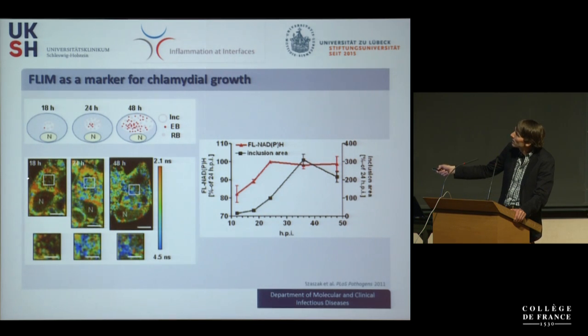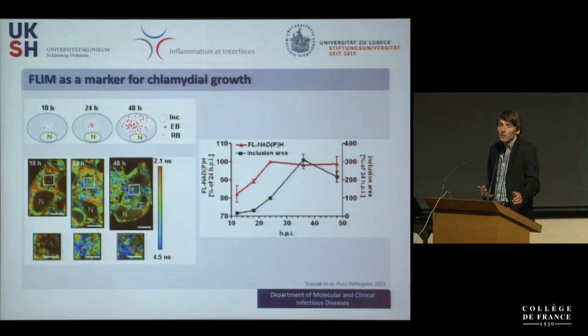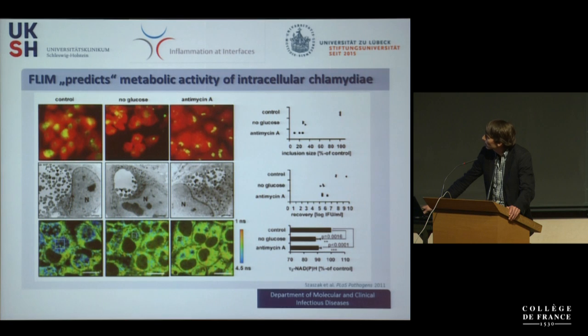So you see here it's measured inside. So you have a shift from smaller fluorescence lifetimes to longer fluorescence lifetimes, indicating that by the interference with the NADPH with the different proteins, you get a higher metabolic activity inside the inclusion.